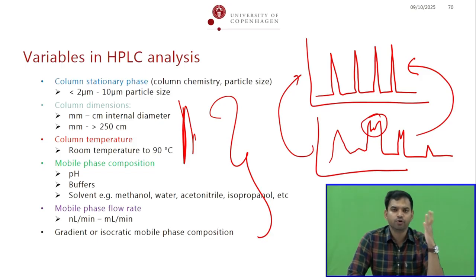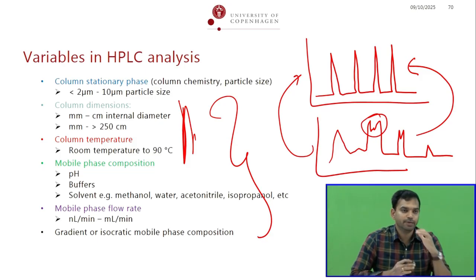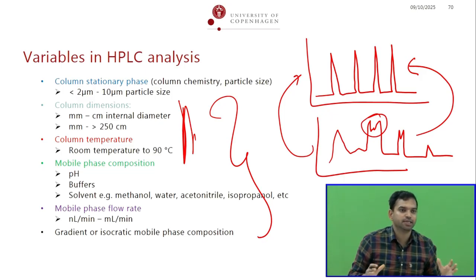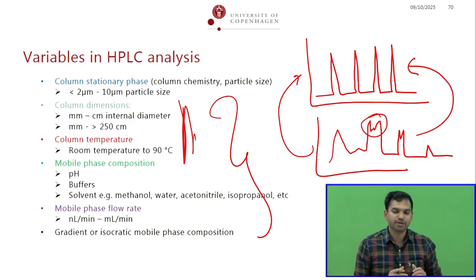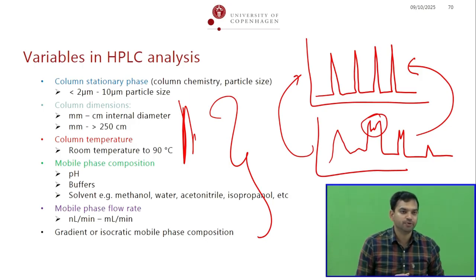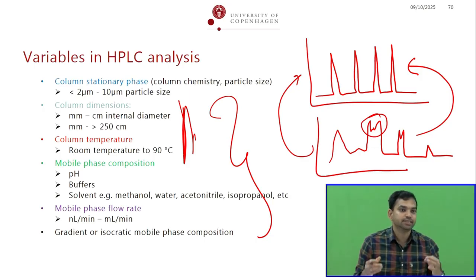And usually, if you go to any chemical laboratory, food analytical chemistry laboratory, there will be a dedicated person handling the HPLC. You have seen that one. They say, don't touch the machine. Oh, I don't want to give it to you. It's simply because it's not that they don't like you to train you. It has a lot of parameters. If you make a small mistake, things can go really wrong.